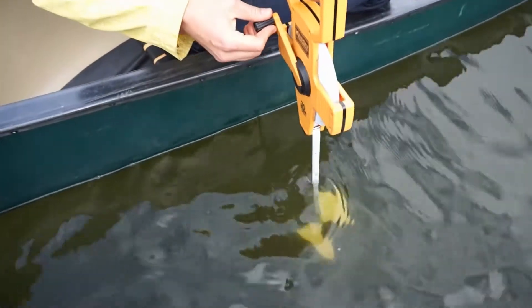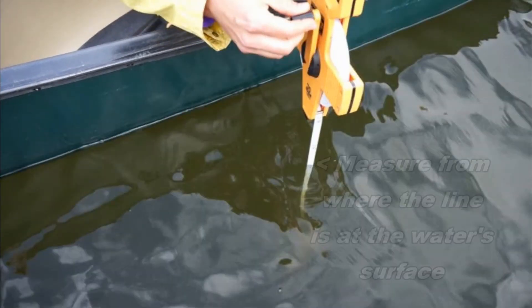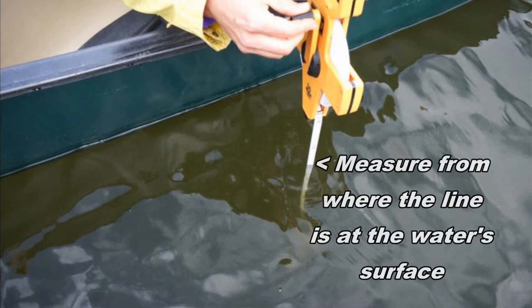You're going to lower the disc down as far as you can until you cannot see any part of the disc, and you're going to record that depth. So 1.4 meters — we'll mark that on the sampling record.